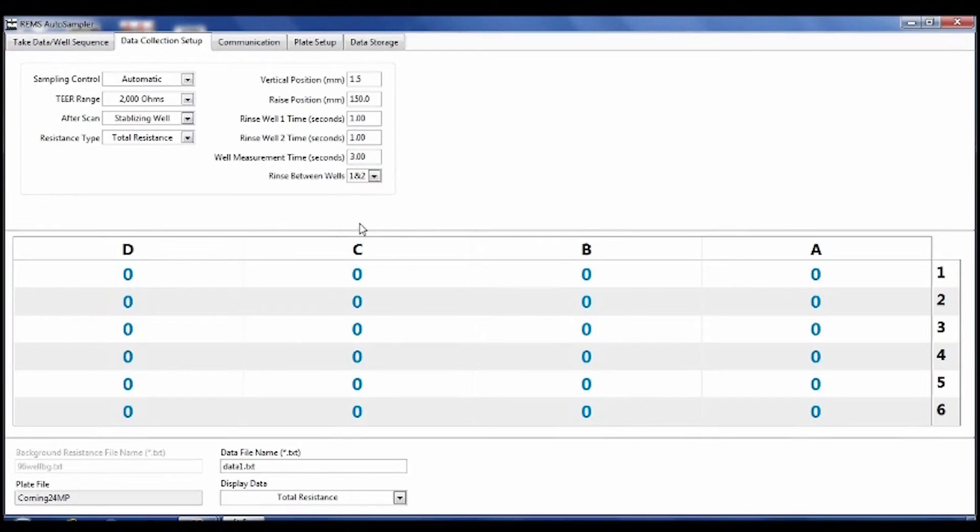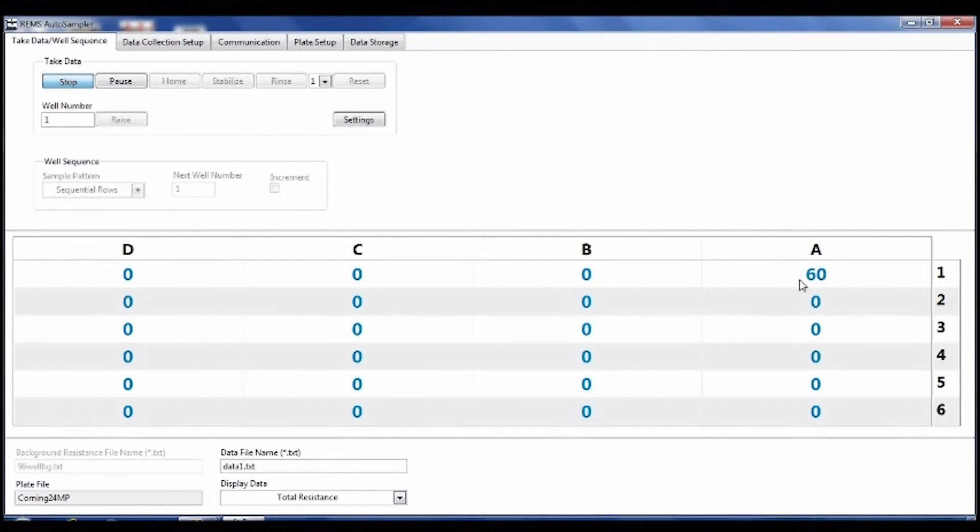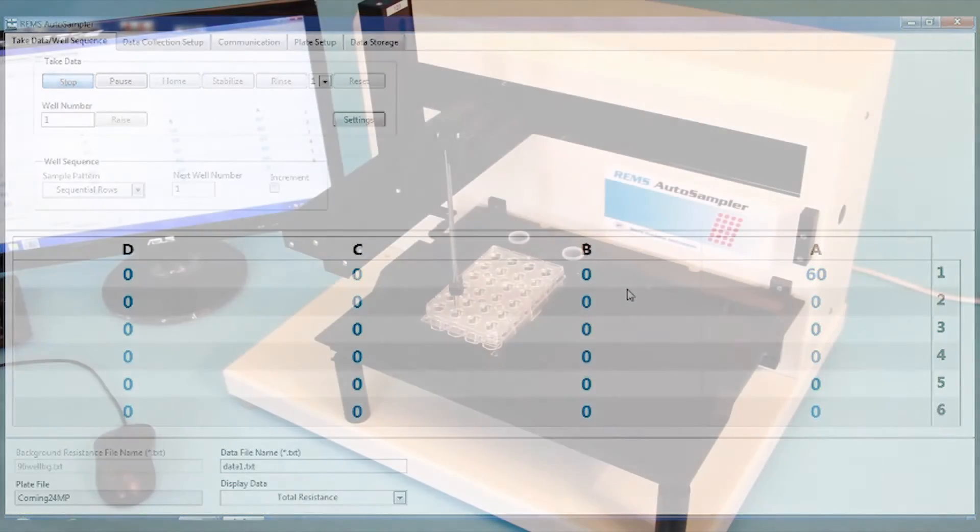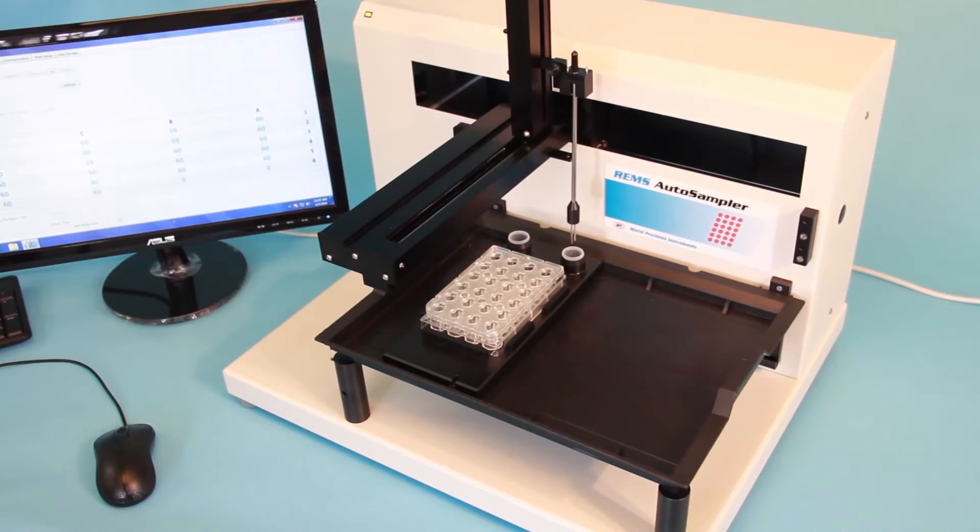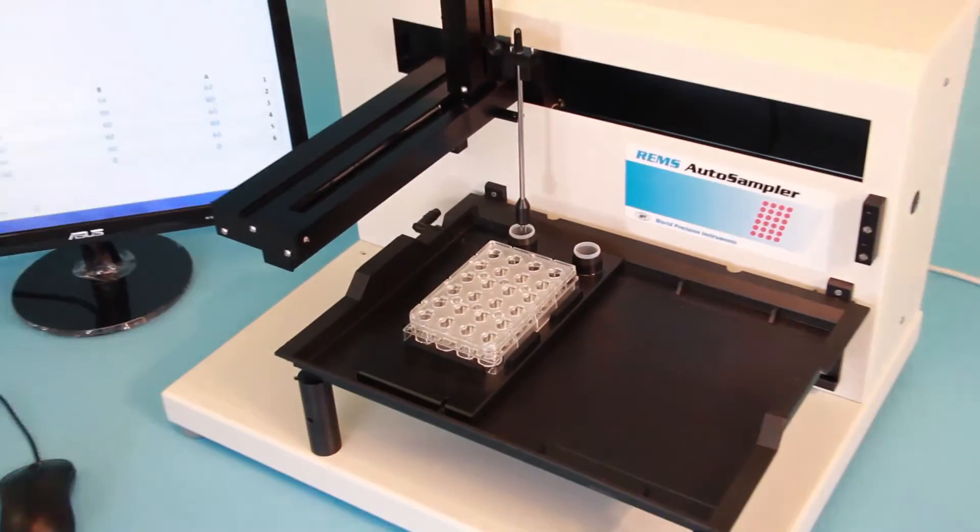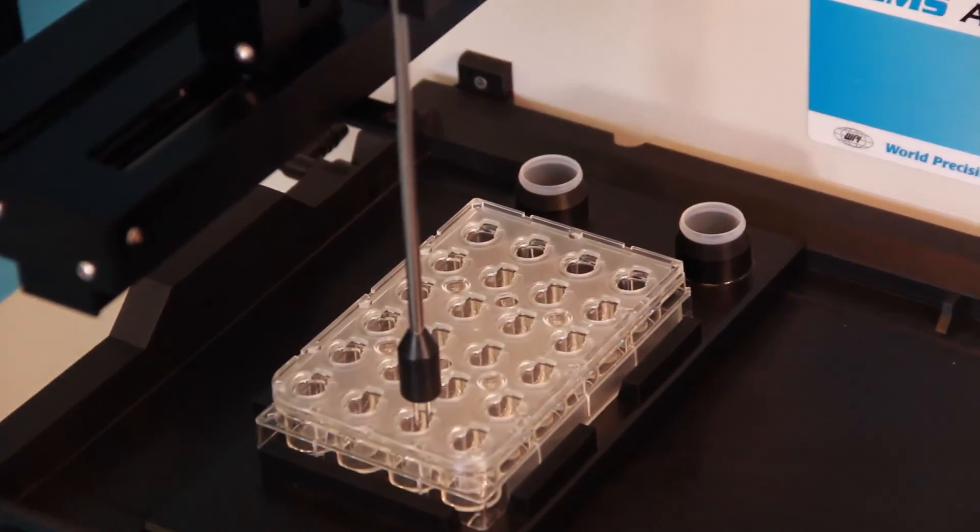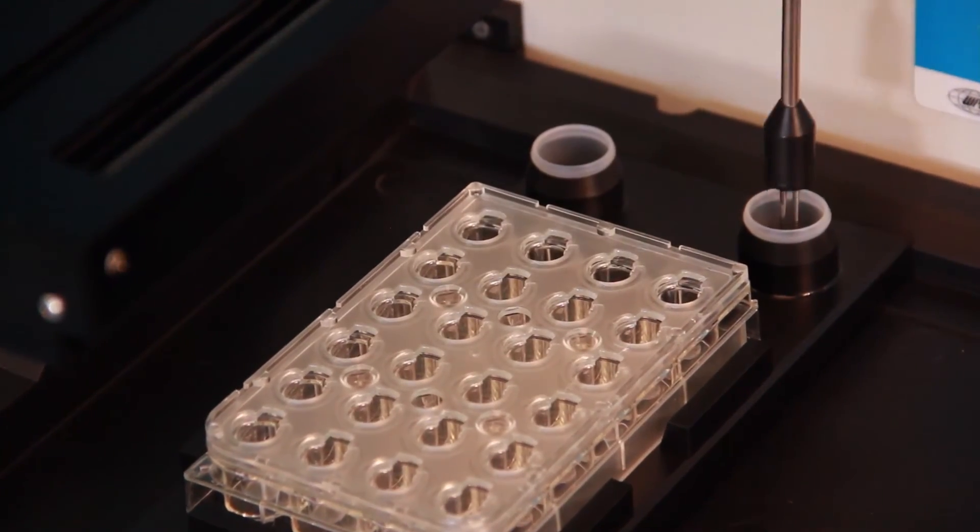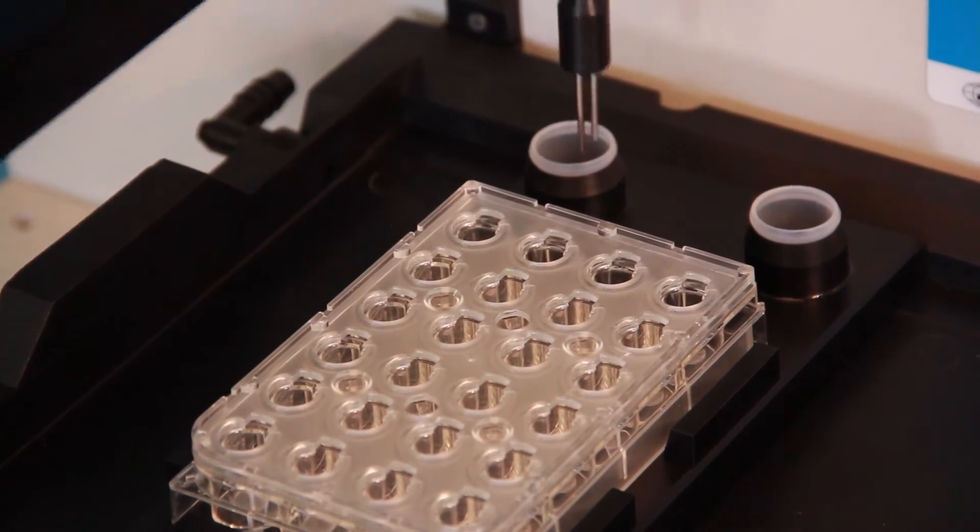In many applications, there is a concern about preventing cross-contamination from well to well. To address this issue, WPI expanded the system to include two user-assignable rinse locations. After each measurement, you can choose to rinse at either station, both stations, or eliminate rinsing from the protocol altogether.